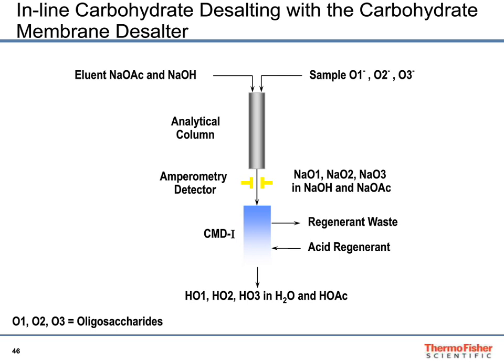But we can also use this offline to prepare samples, which could then be used for MALDI-TOF, used for electrospray by infusion, or used for NMR, for instance.